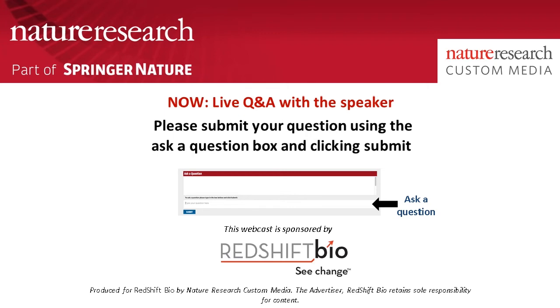Okay, thank you. Perhaps something for us to follow up on after the webinar. Our next question asks, is there any water vapor subtraction applied to the MMS spectra?